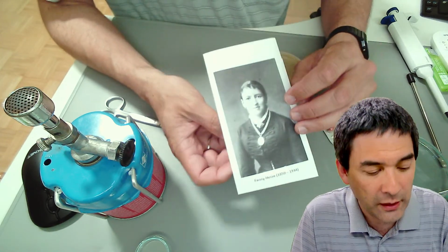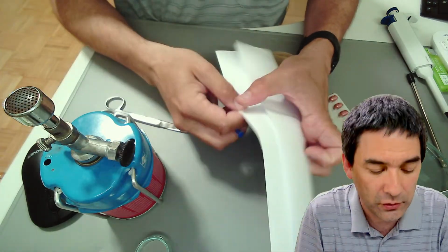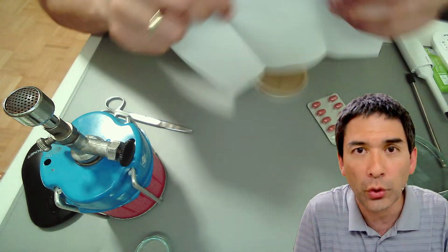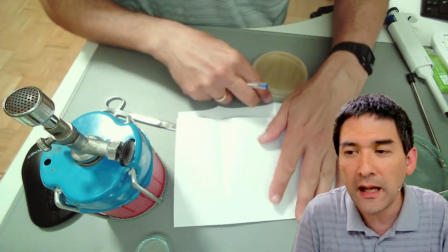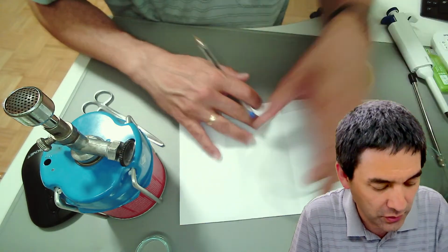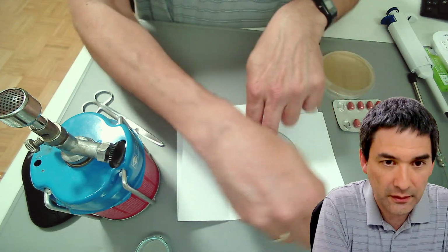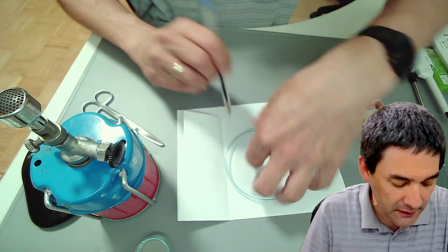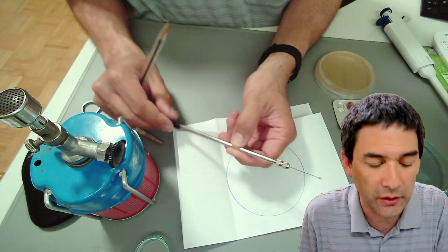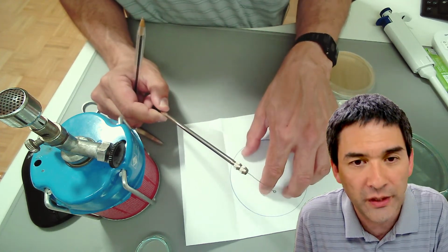So what I'm going to do now is use a pen, and explain to you in theory what I'm going to be doing so that you understand better. I'm going to show you how to make a so-called dilution streak. I'm just going to use this here as my agar plate. And I'll be using this tool, called an inoculation loop, to pick up the bacteria and transfer them onto the agar.